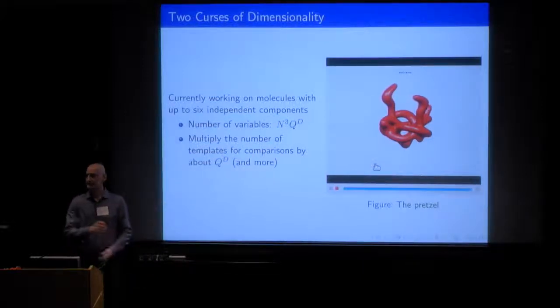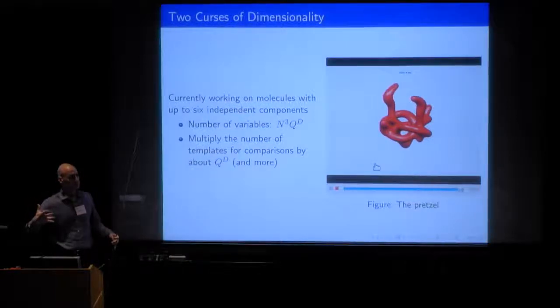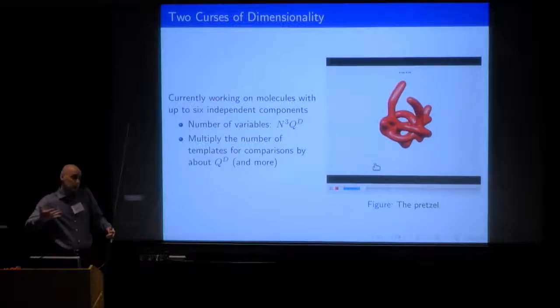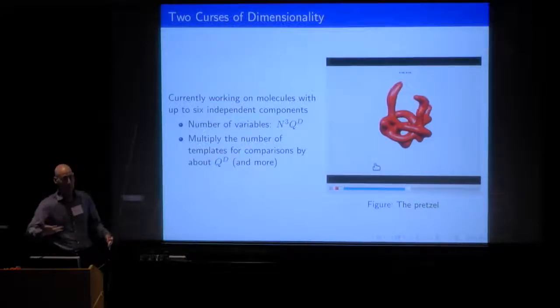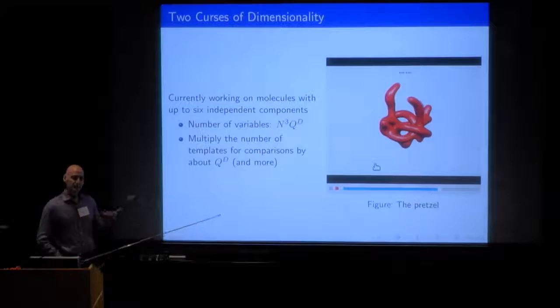And it sort of makes sense, because if there are so many possible states or conformations that we want to look at, we would need to have at least some information about some of them, right? And since there are so many of them, how can we cover all of them? Additionally, there is a computational problem.